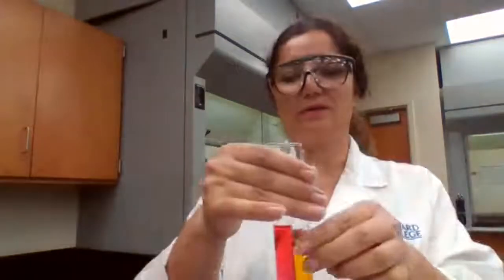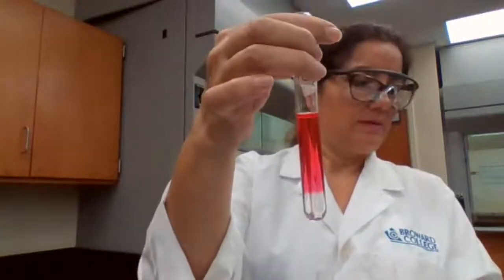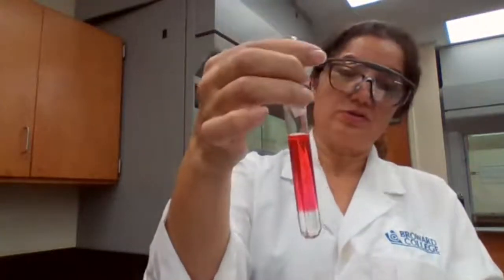So you want to see what is the effect of adding H+ or adding OH- to the color of the indicator. In acidic solution, you have extra H+.